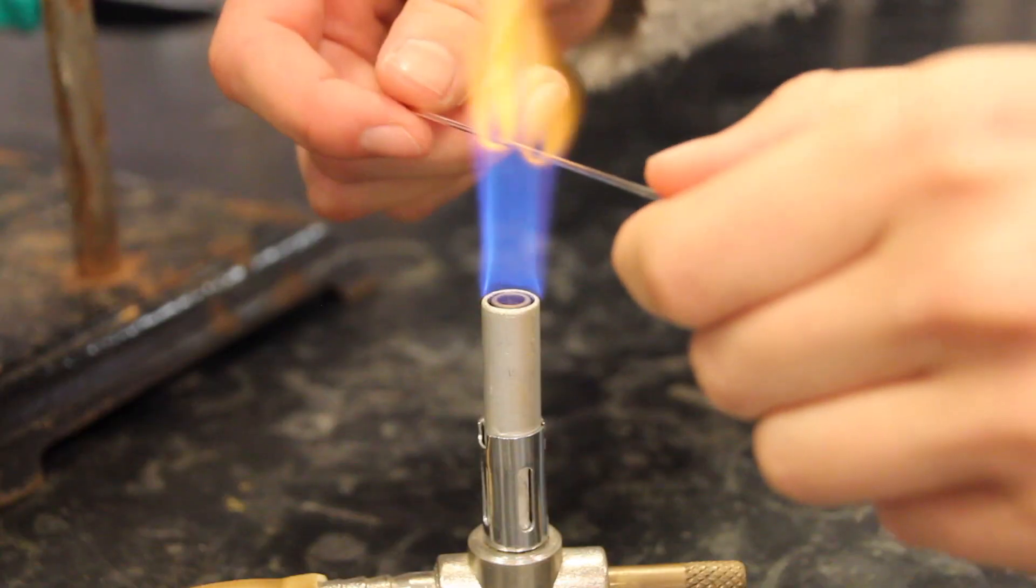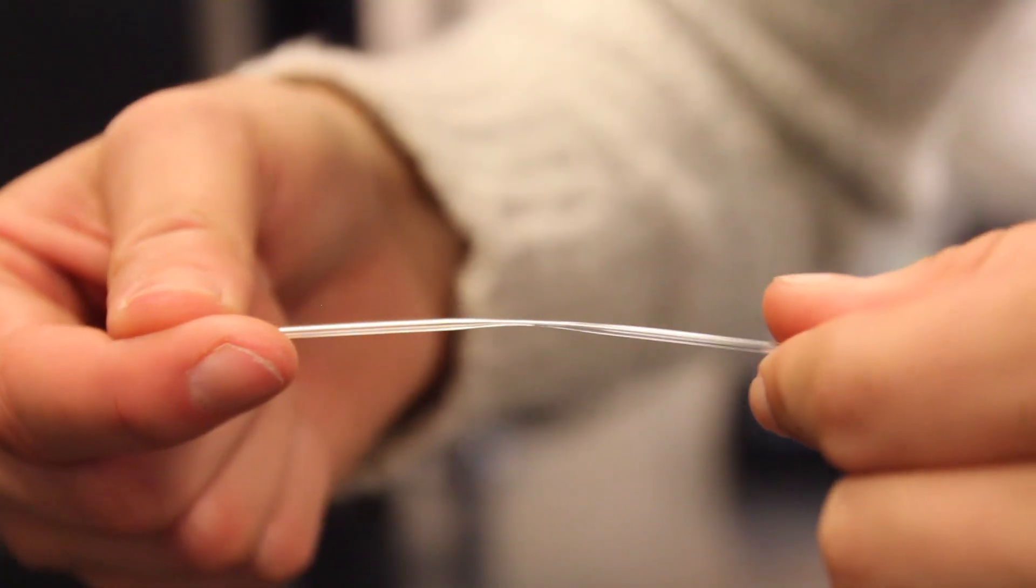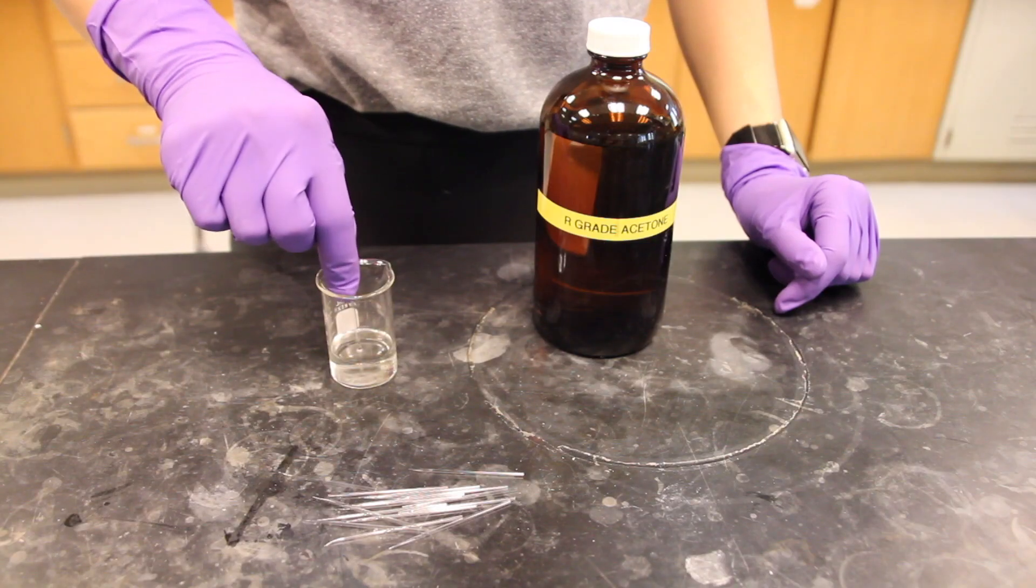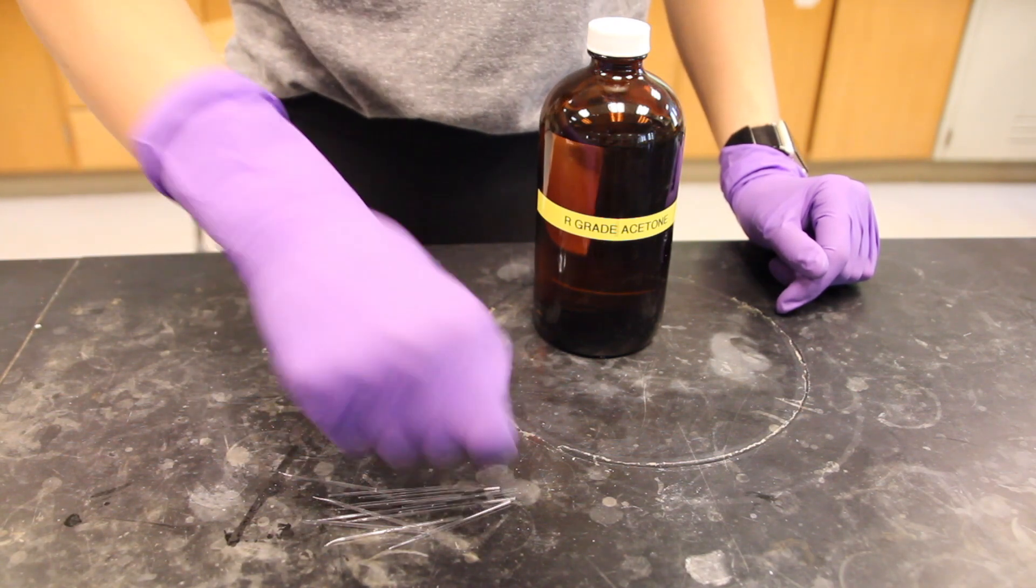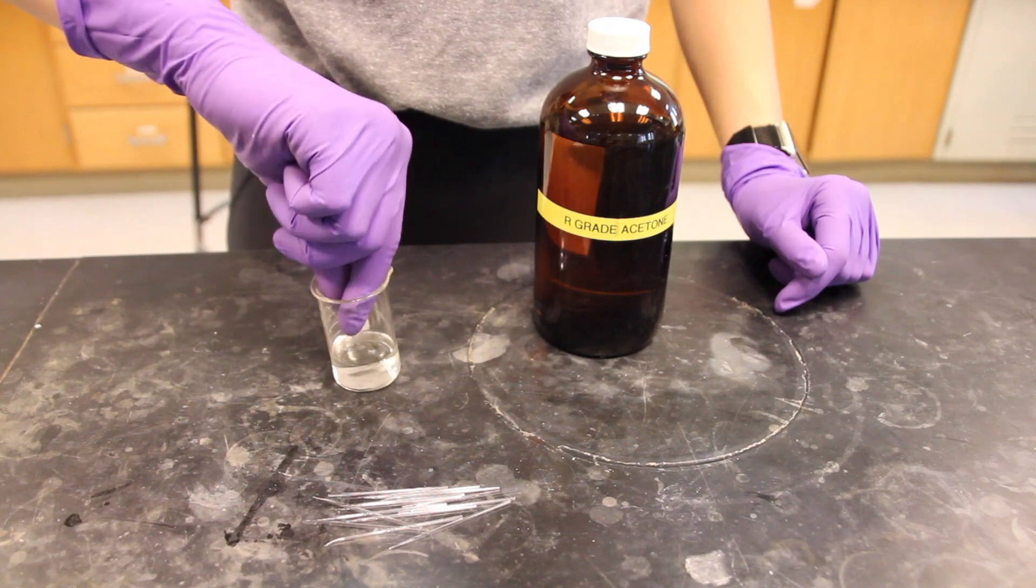Prepare at least 12 capillary micropipettes for use in spotting the plates. The procedure for creating these will be explained during your pre-lab lecture. If you would like to wash your capillaries and reuse them, refer to your lab manual for the correct procedure.